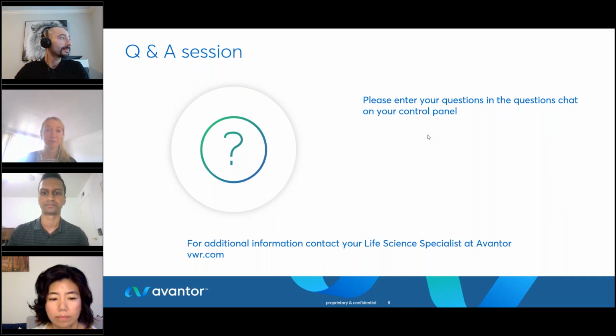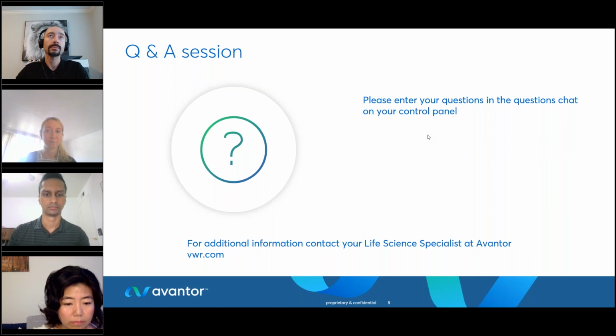If there is an interest for a reference-based mode, and we raise it in the community, then that's something we could consider adding. And as mentioned before, unfortunately, it's not set up to detect contaminants or if there are multiple plasmids. But if we were to add a reference-based mode, it would be easy for us to add a variant calling step, which would help to detect that kind of contamination.